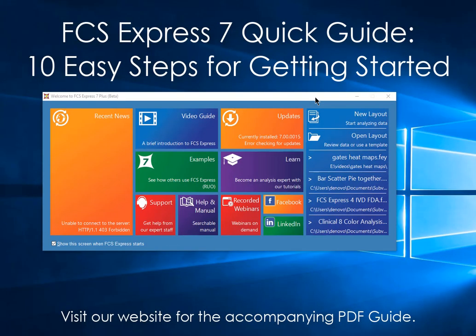In this short video, we'll show you 10 easy steps for getting started with FCS Express. You can use any of your own data files to follow along.